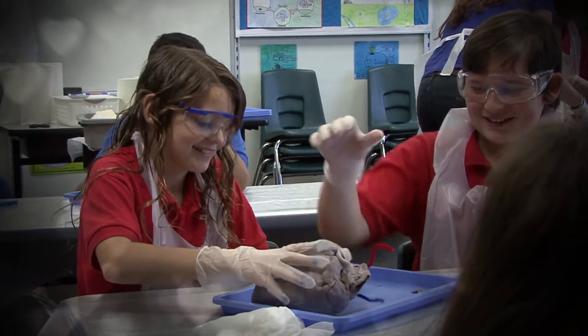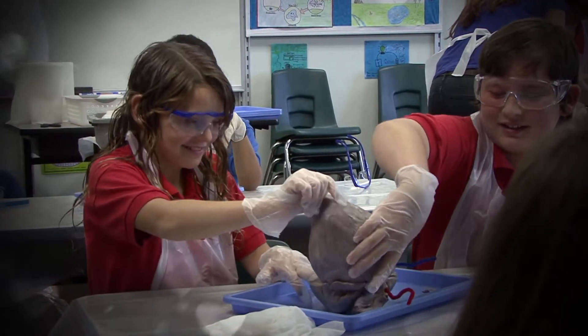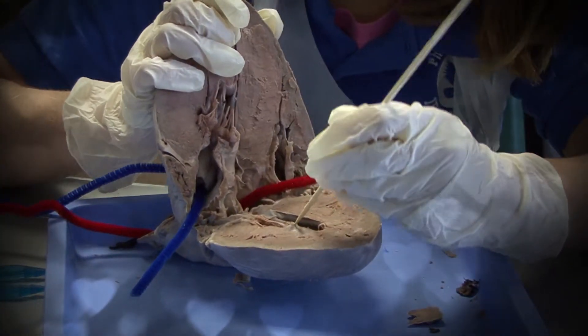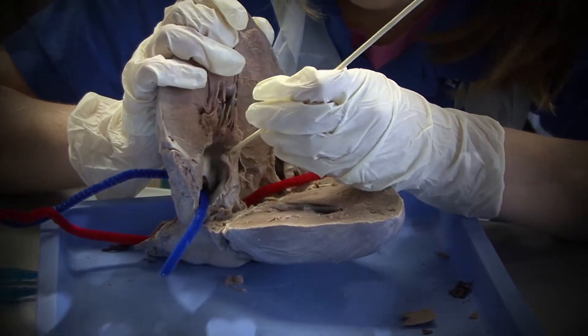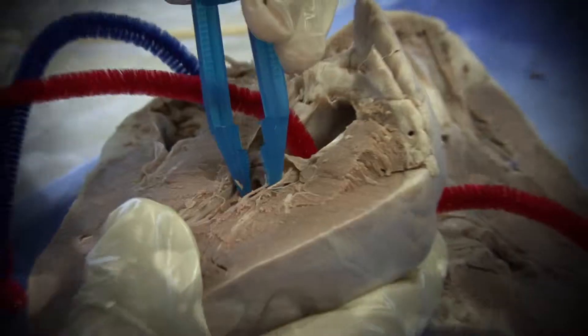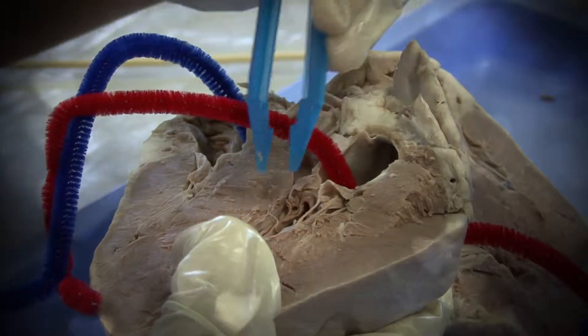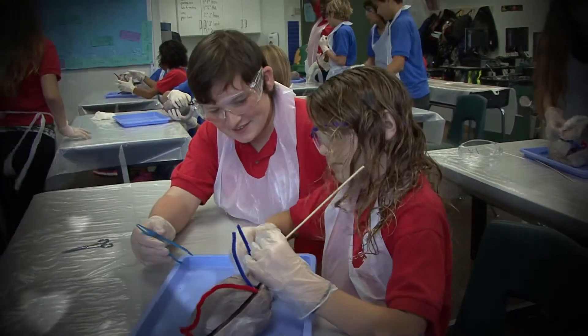Is it what you thought it would be? No. What's different than you thought it would be, Alyssa? I thought it would be smaller. You thought it would be smaller? Kevin, what's different than you thought? I thought it would be redder inside. You thought it would be redder inside?